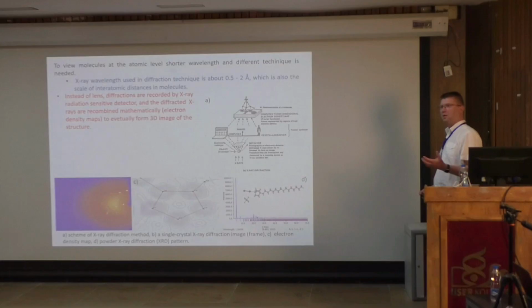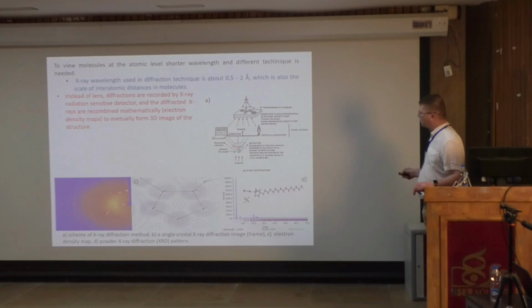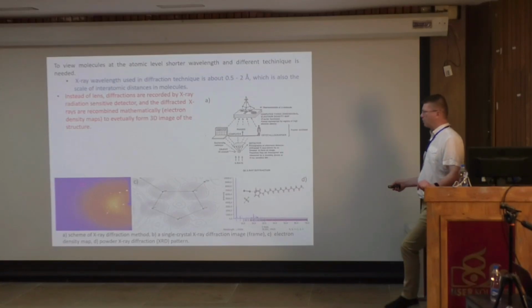This is what we see. We don't see the molecule, we see the electron density map. So we see this kind of a thing. Look here, the big hills here. This is what we see. And we have to decide ourselves, this is nitrogen, and this is carbon, and so on. There are some hints and additional things which will help us. But that's the point. So this part here now, the diffraction image looks like this. And later on in the course we will see more examples of these images.